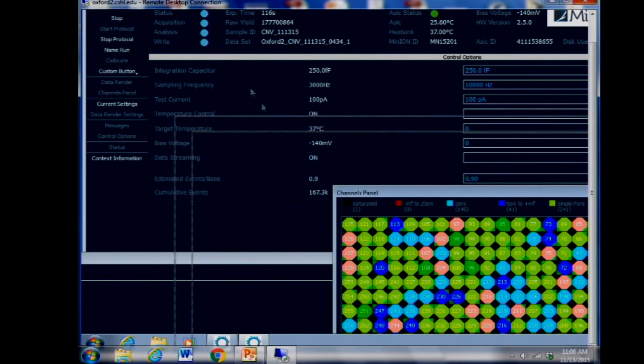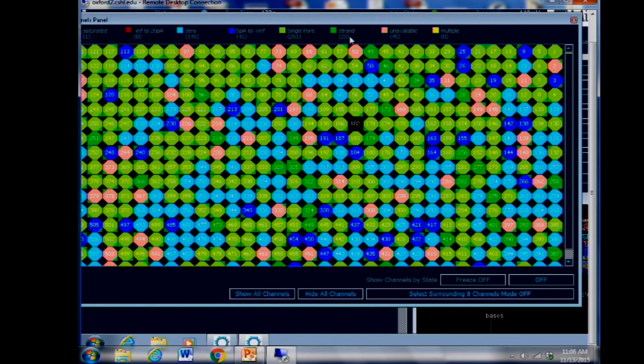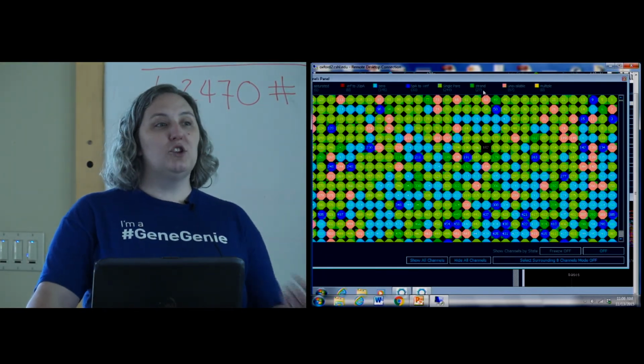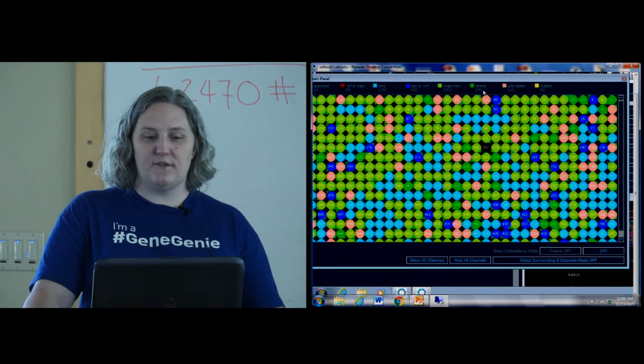Okay, so let's shrink this down. Let's bring this one up. Okay, so here's what we see here. Now, as you can see, the strand numbers are slowly going up. That's really good. That's what makes us happy. That means we're having more of these DNA fragments diffusing down to the surface of the flow cell and then getting captured by the tether and brought to the surface of the flow cell.